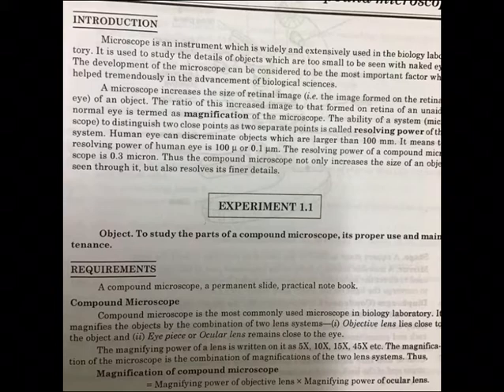As part of your syllabus, we have experiment number 1, to study the parts of compound microscope. Of course, once you come back to the school, you will be touching it, operating it, feeling it, all that. At present, you can only see, and I will be sending one virtual lab, O-Labs it's called, sent by CBSE. You can log into that and see the virtual mode of doing the experiment also, as long as you are at home. With that background, now I am going for experiment number 1, study of the parts of compound microscope.